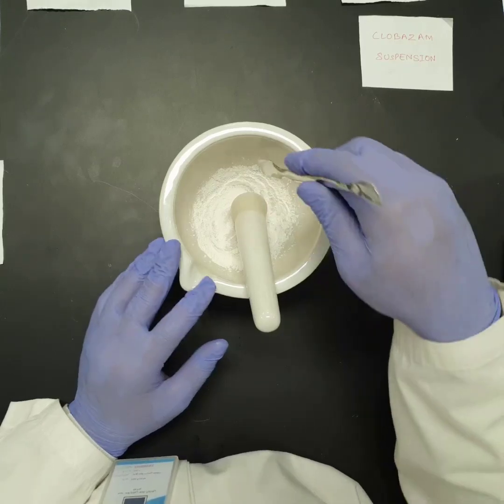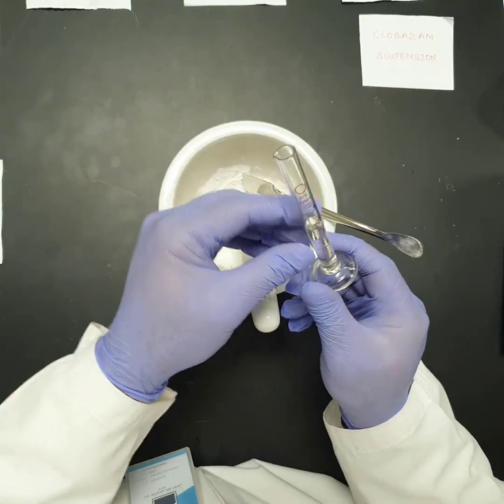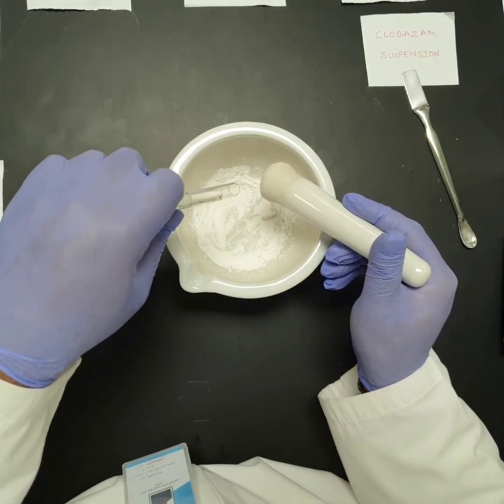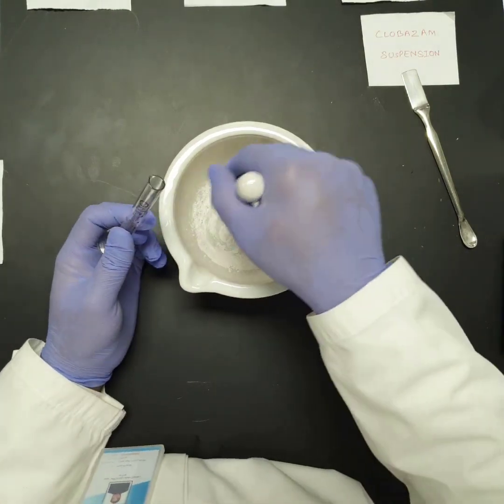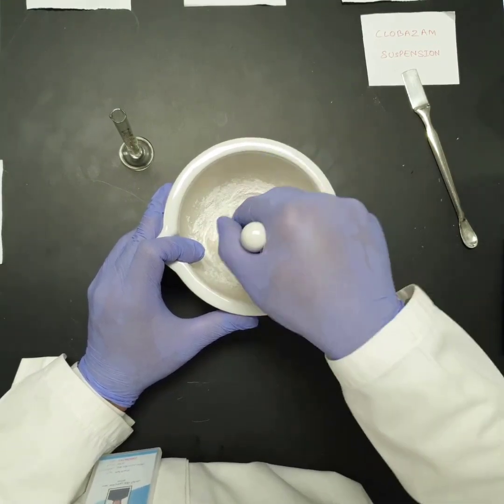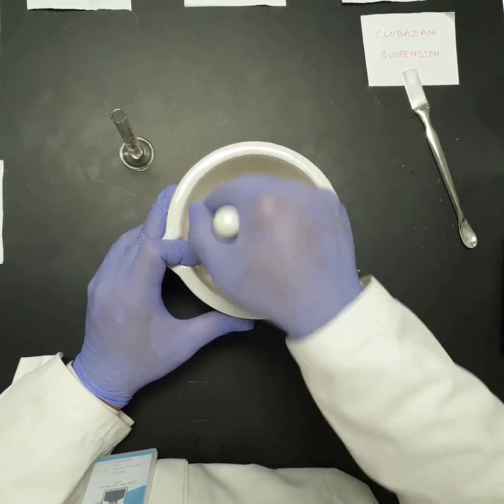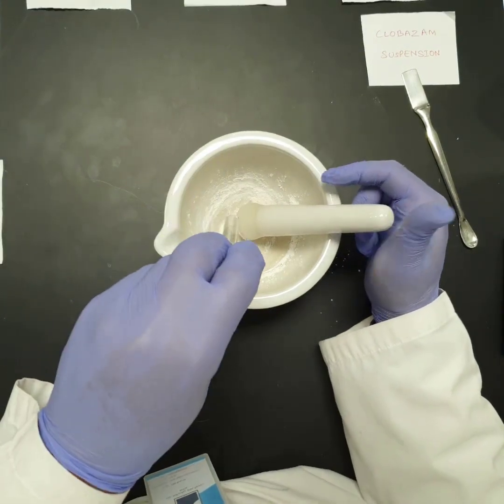Now we should add glycerol, 3 ml. This is glycerol. We are going to add glycerol. We can add all the glycerol at once, but it's better to add a little amount, mix it, and then add the remaining amount. Now I'm adding all the remaining amount of glycerol.